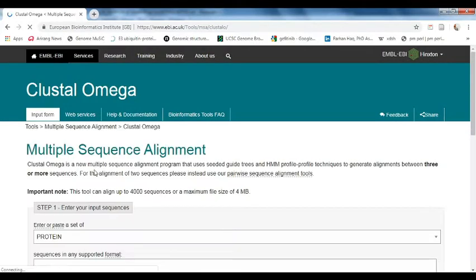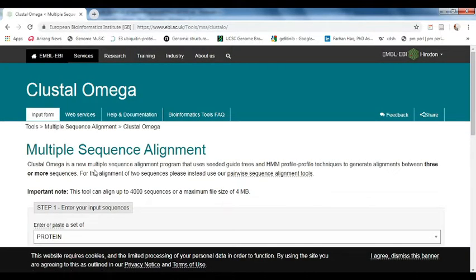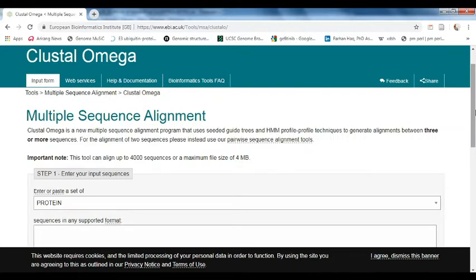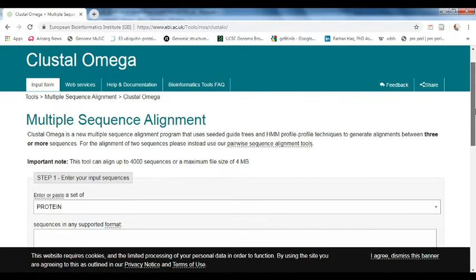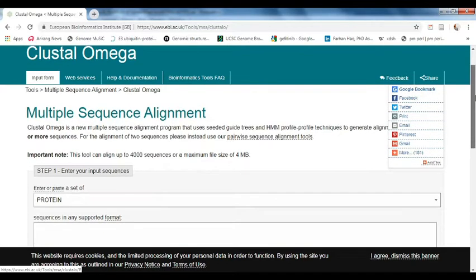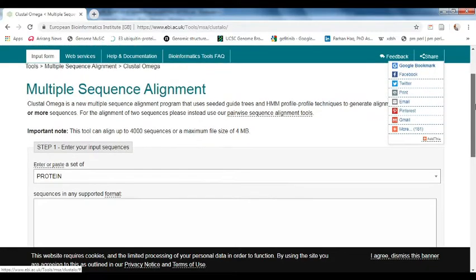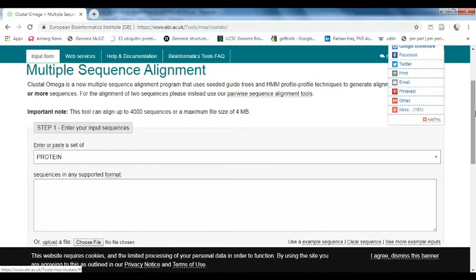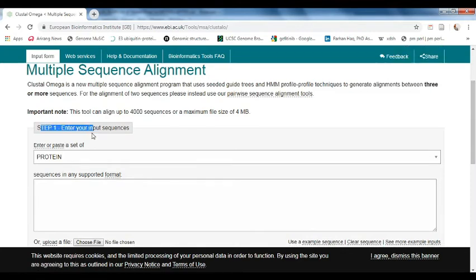There are multiple tools which can be used for multiple sequence alignment, like LALIGN, CLUSTALW, and Clustal Omega. The purpose of all of them is similar — performing multiple sequence alignment — but there are some slight differences in their algorithms. We will use Clustal Omega, which is available on the European Bioinformatics Institute website (EBI). Search for the multiple sequence alignment tool and click the link. The tool can align up to four thousand sequences.